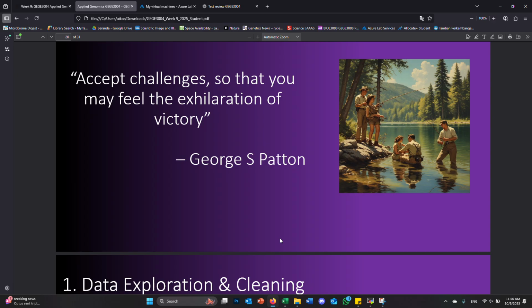Once you have done that, run the command line prompt you see on the screen: java space -jar space haploview.jar. Give it a moment, it will take a bit to open on your computer.